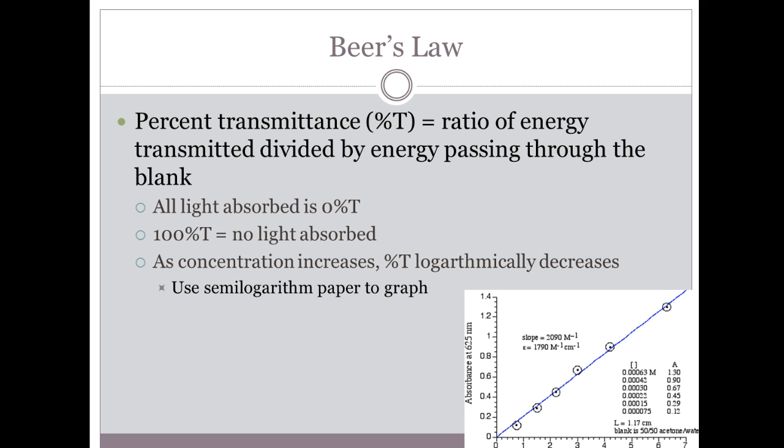Well, we do use this when we talk about light being transmitted and light being absorbed. The percent transmittance, or remember the flashlight, this is essentially how a spectrophotometer works. We shine a flashlight through that beer. There's something on the other side of that beer picking out how much light was transmitted through. The Guinness didn't transmit very much light at all, so our detector on the other side would say, oh, it didn't pick up much light, it's very concentrated.